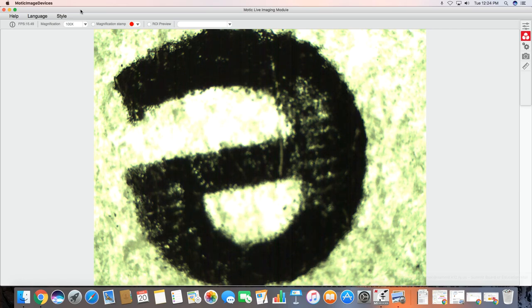Much more zoomed in but you'll notice the E is upside down and backwards. It's completely flipped around. Upside down and backwards.